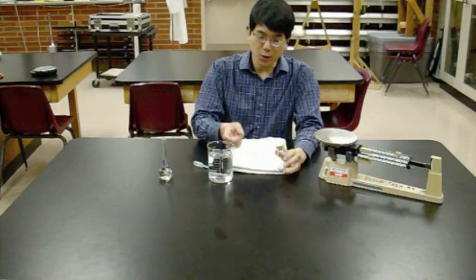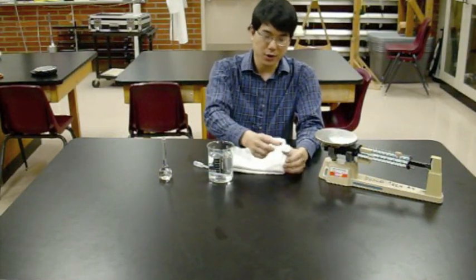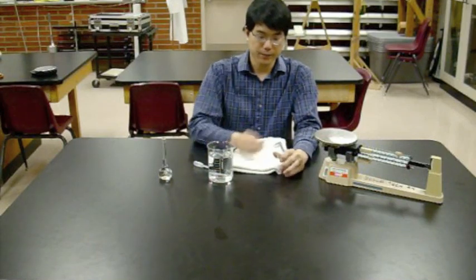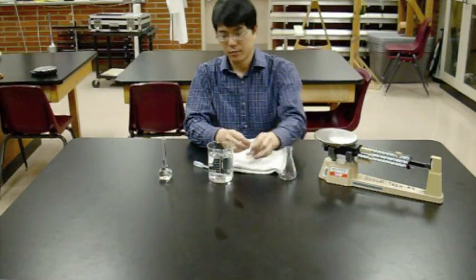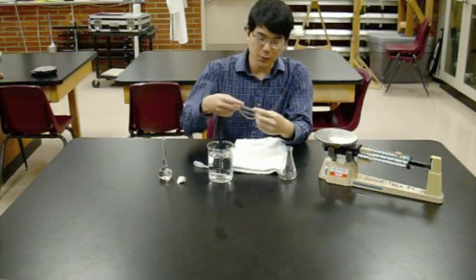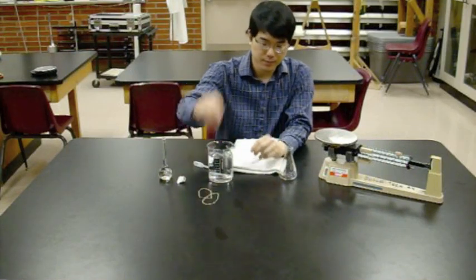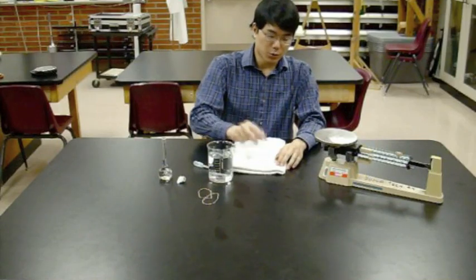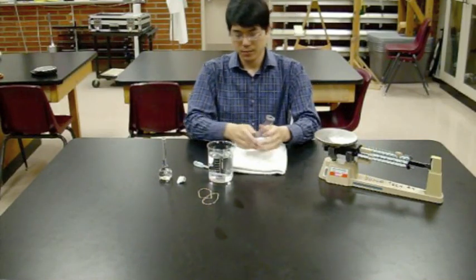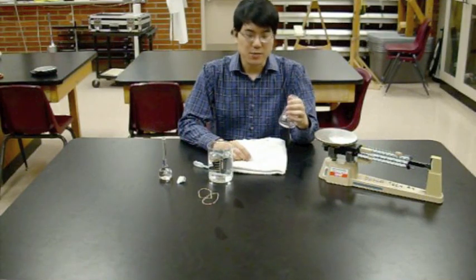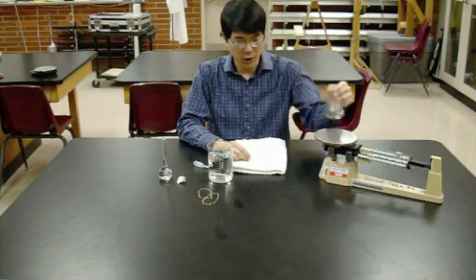First things first, you need to get water into here. So you need to take off that cap you put on in part one. Aluminum foil you can throw out. Try to keep the rubber bands if you can. Empty out any residual unknown.